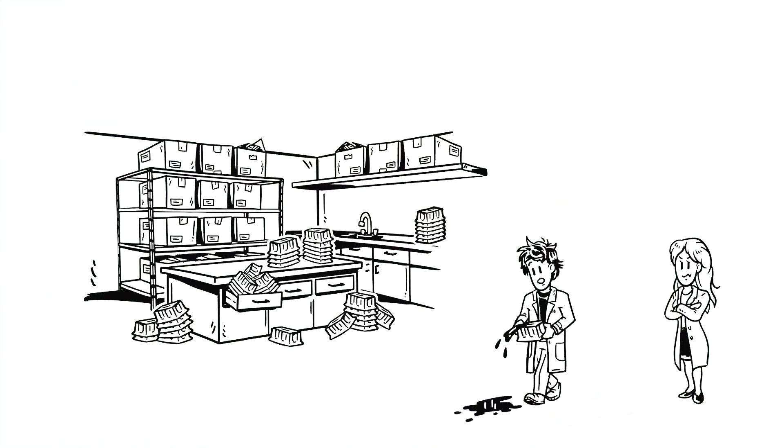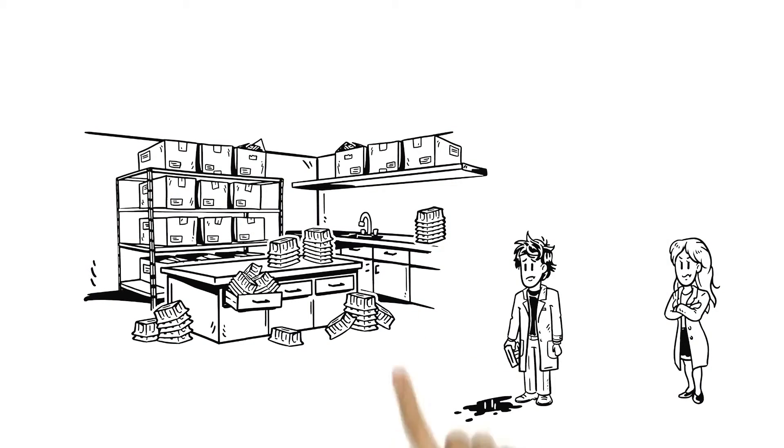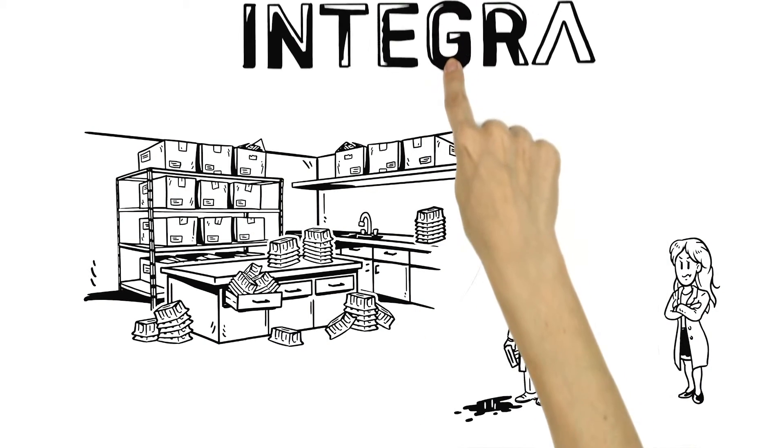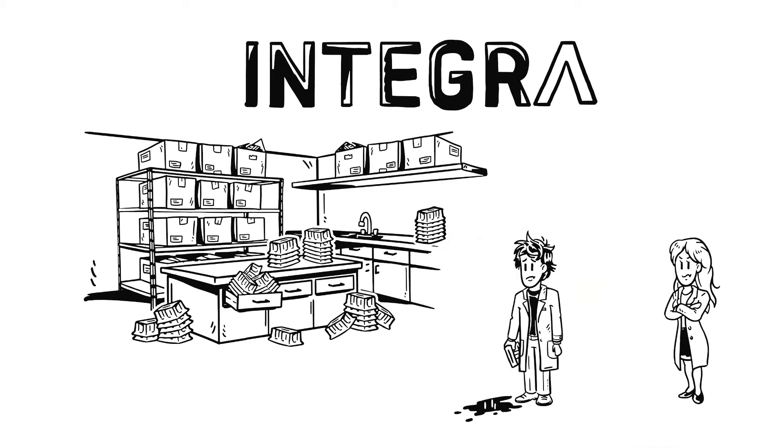Mary, frustrated with Mason's mess, recommends Integra's Reagent Reservoirs.